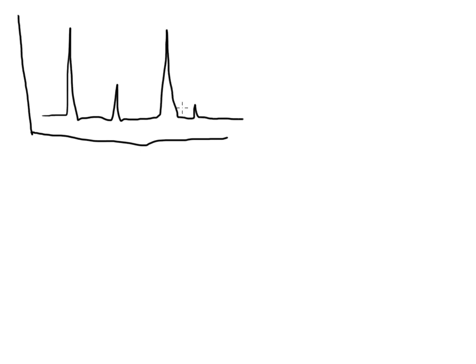And one of the first things that we need to talk about is data that comes from an instrument when we begin to analyze samples on equipment and not on my handmade columns. Okay? So what you're going to see is basically a graph that would look something similar to this when we start getting data from the instrumentation.